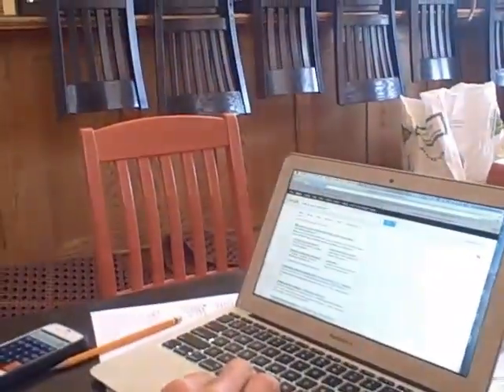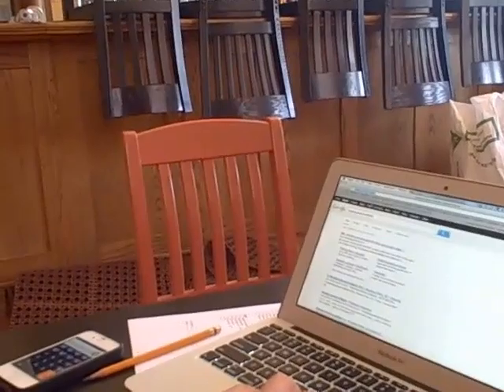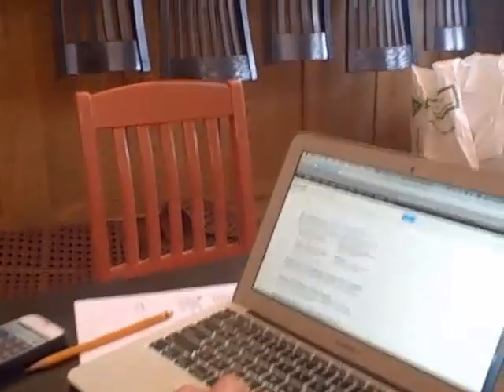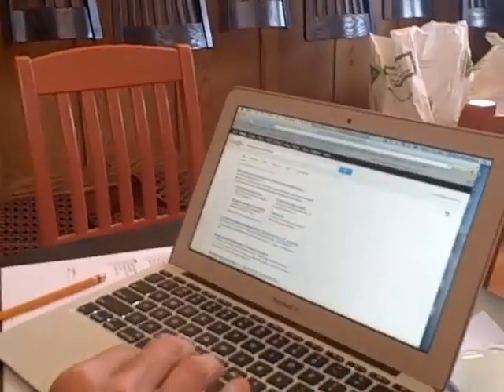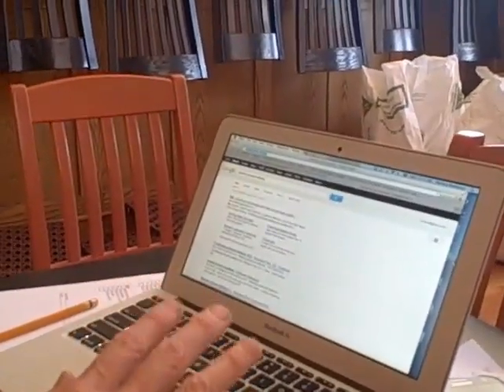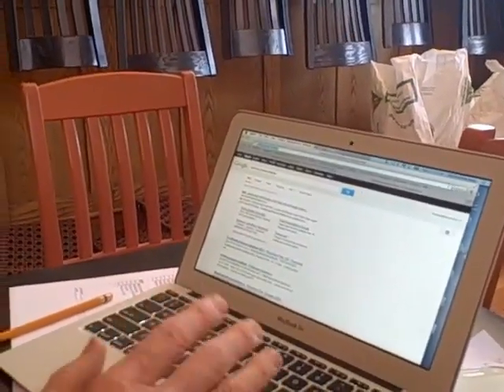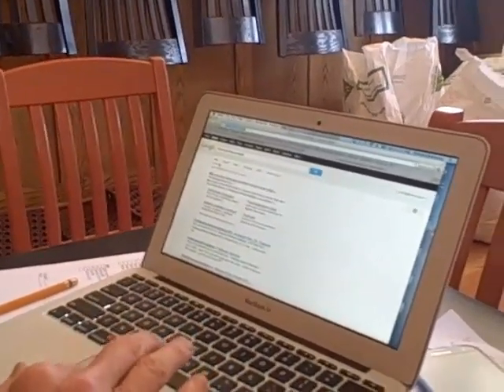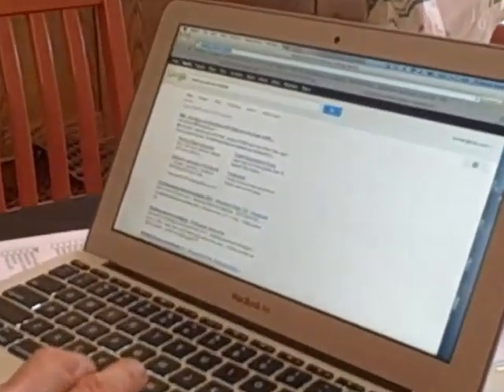Okay, so now what we're doing, excuse the noise if we're using the pump, but I like to use Brewing Science Institute's website.